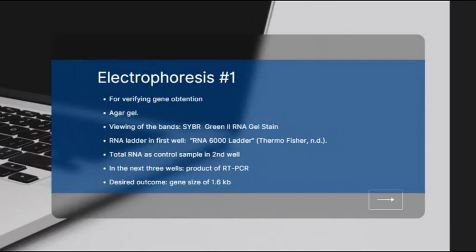RNA stain for viewing the bands is used. In the first well goes an RNA ladder, in the second one the total RNA as control sample. Then there is the RT-PCR product in the next 3 wells. A 1.6 kilobase band is expected, being the NIA gene.